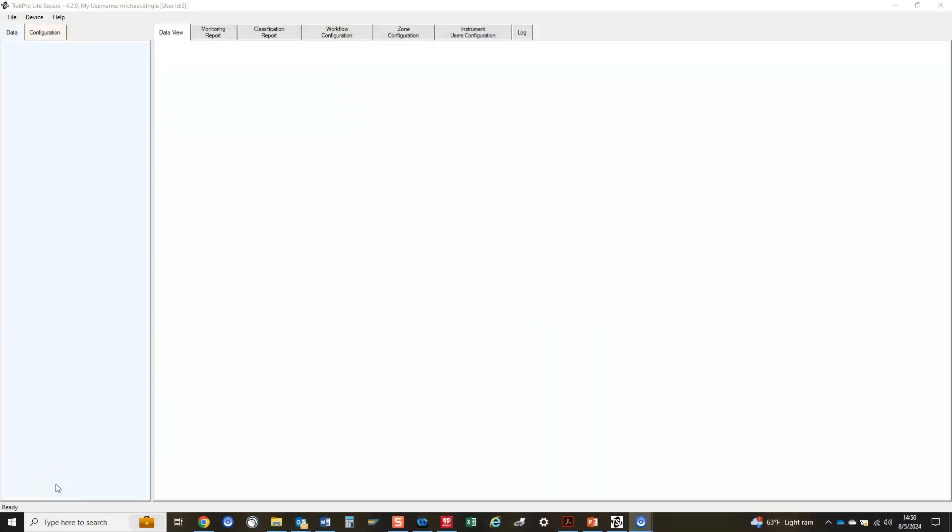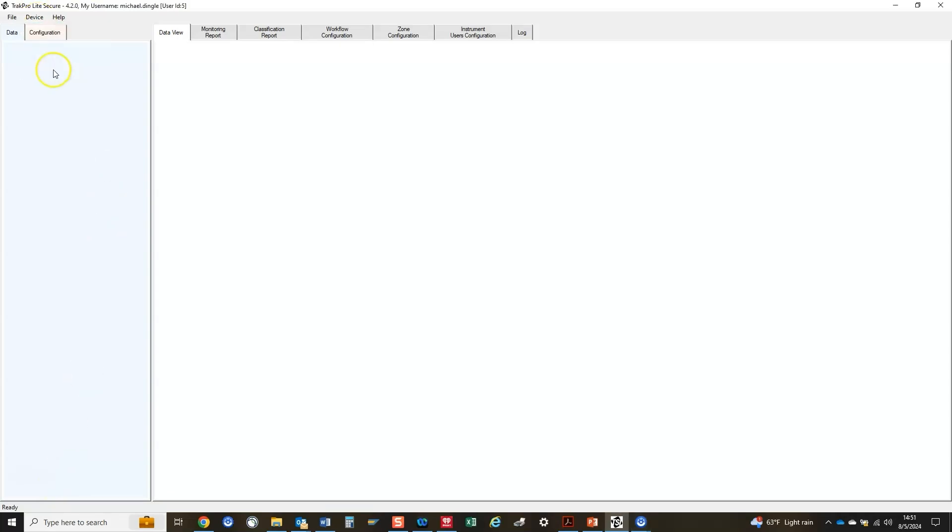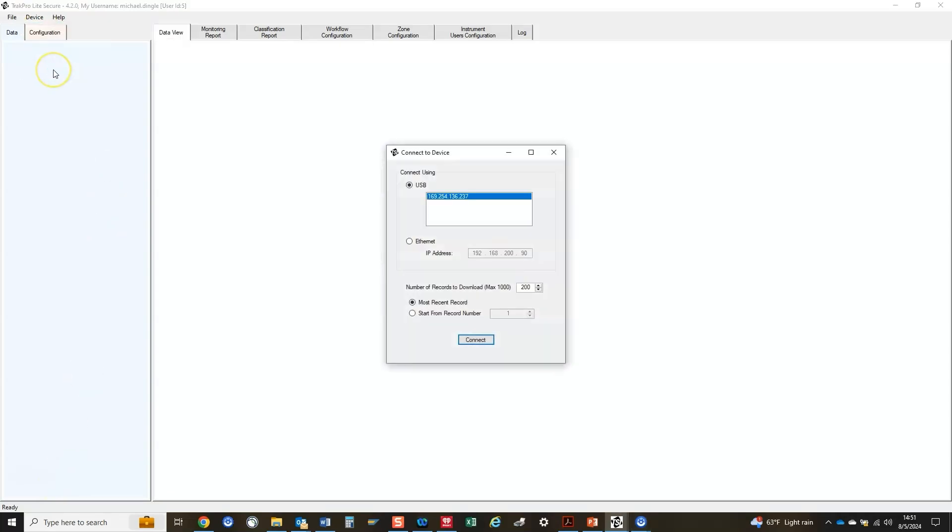To finish the connection in TPLS, select Connect under Device on the menu bar. Select your desired connection method. If using Ethernet, select Ethernet and enter the IP address. If using USB, simply select USB.